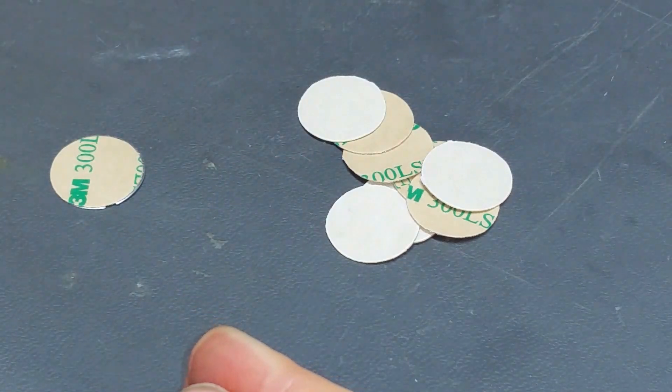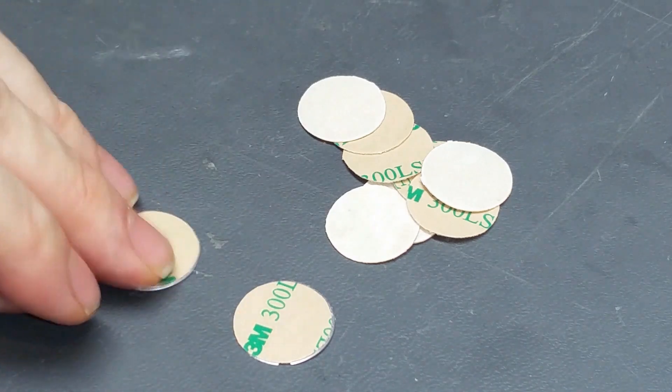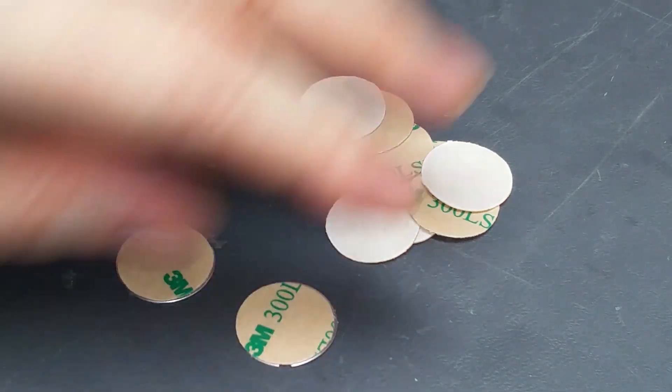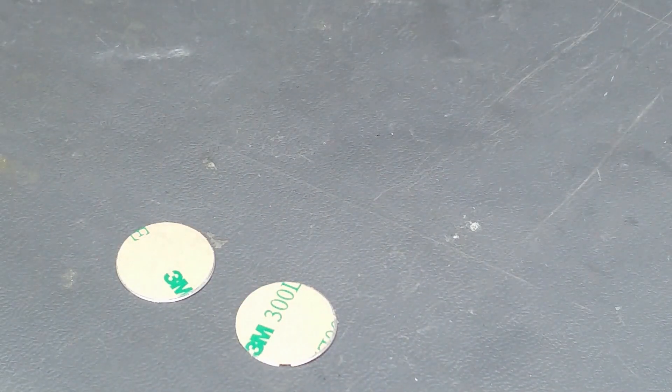So now we have two dots, two knob caps, two discs, whatever you want to call them, with freshly applied adhesive. And we actually have some leftovers here that I can save for the next time. We'll put those on the scope now.